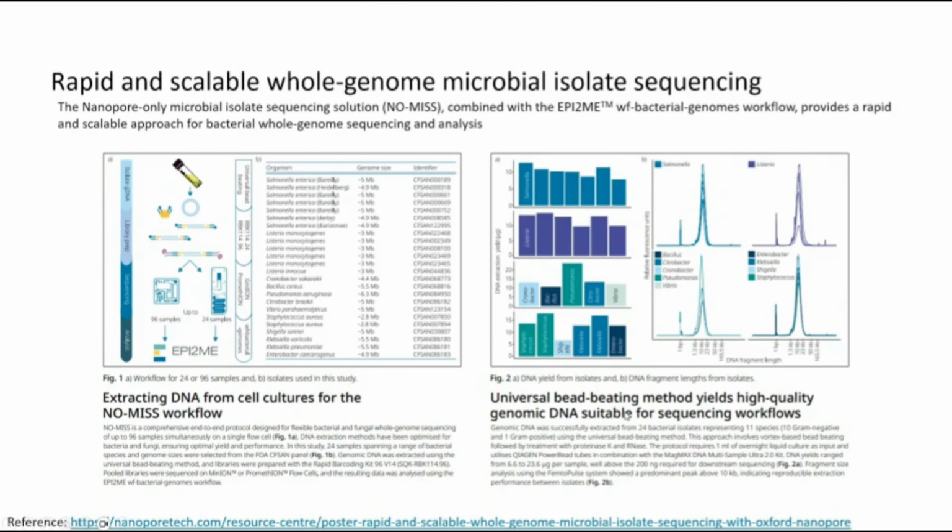Even though nanopore sequencing is not very demanding in terms of the samples required, it is still best to have good DNA samples before sequencing, because that guarantees better results at the end. Most of the samples managed to give good quantity and good quality DNA, and some had a slightly lower throughput.